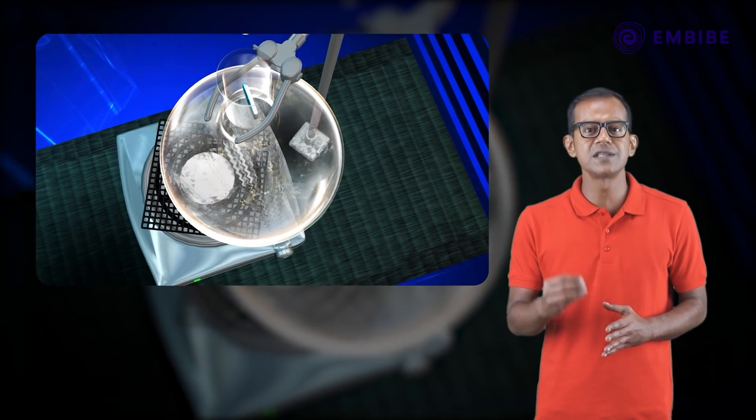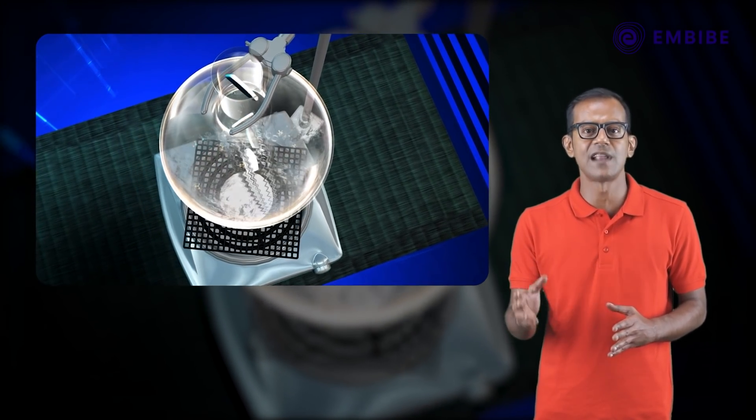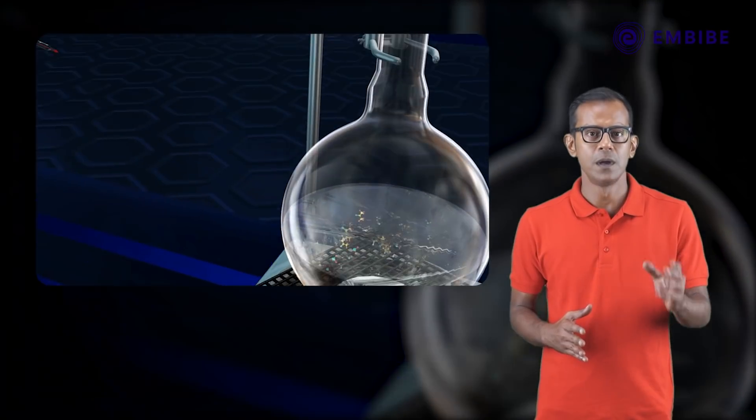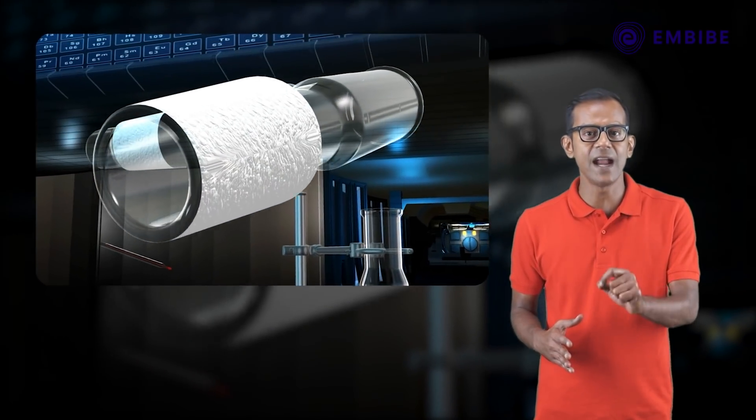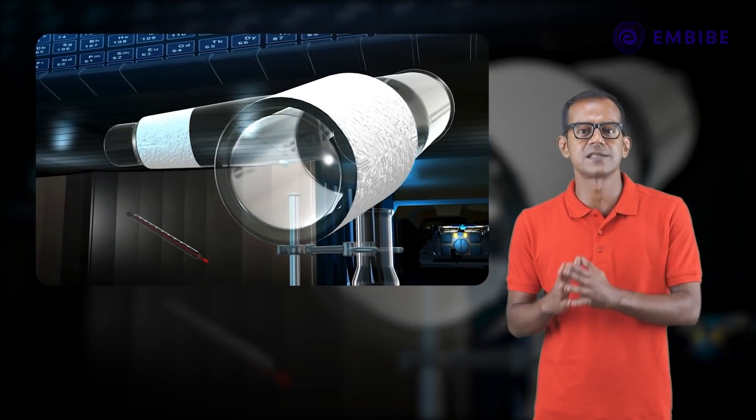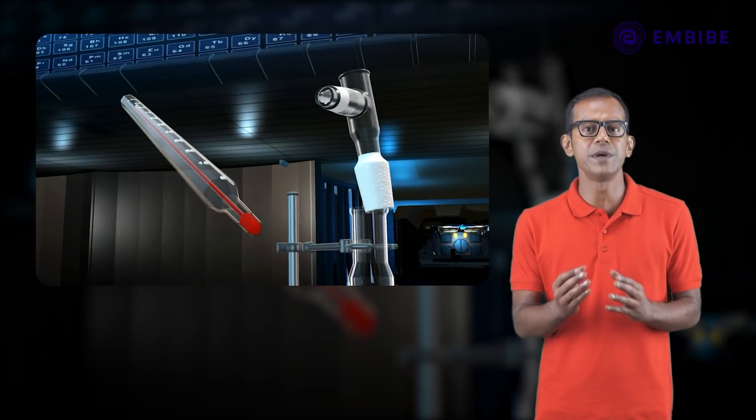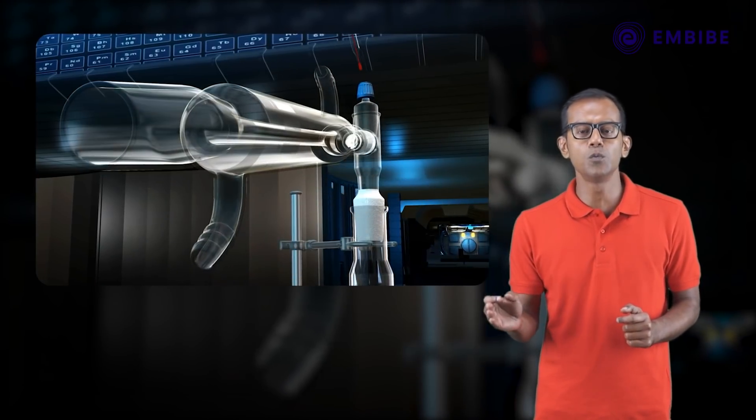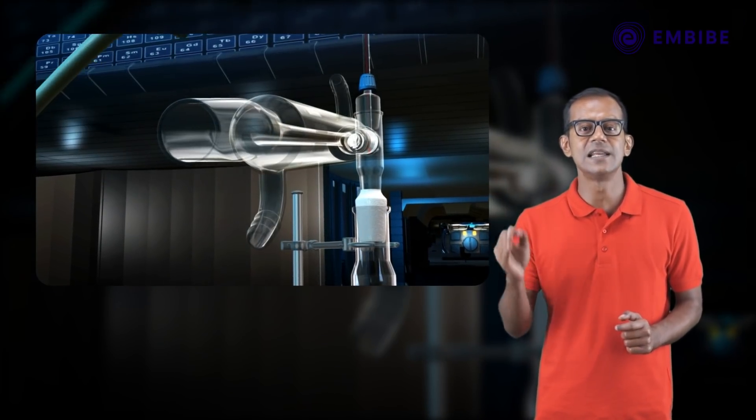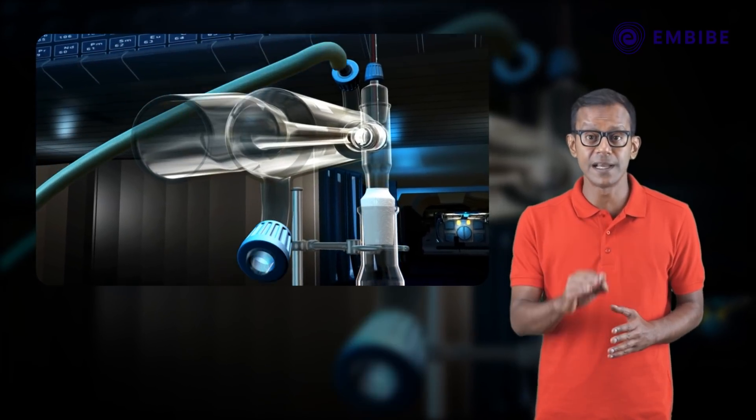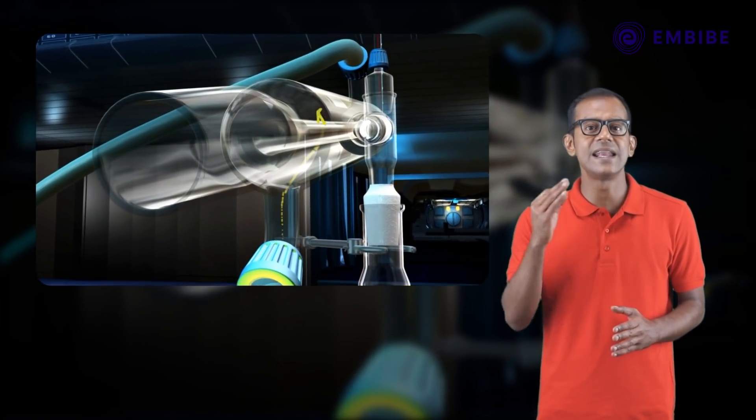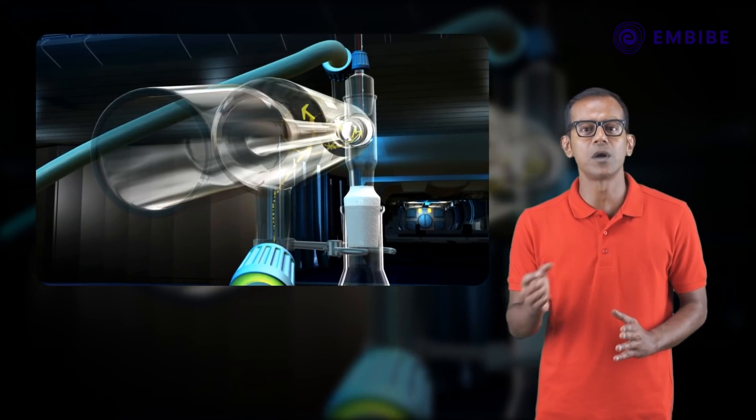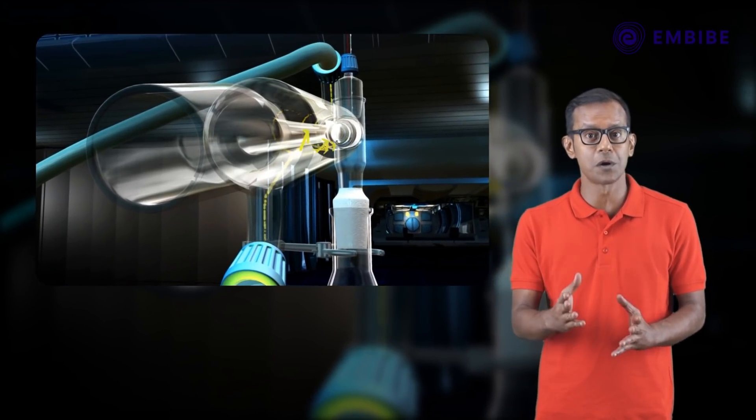Add some porous pot chips into the flask. Position a hot plate underneath. Now connect a distilling head to the RB flask. Join a thermometer to one end and a condenser tube to the other end of the distilling head.